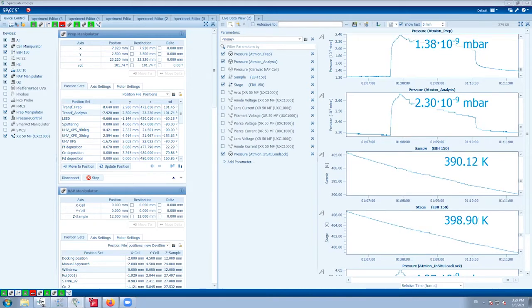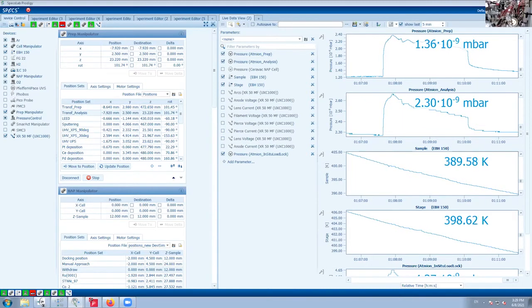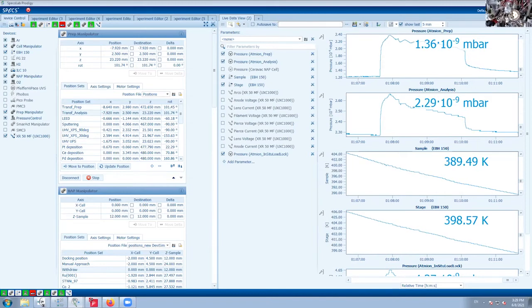So now maybe we can try to take this camera, if it's okay. I don't know, it's too short maybe. Can you move a bit with the computer, maybe several? So maybe you can see something there. Yeah, there is a window, and in that window there is a manipulator.